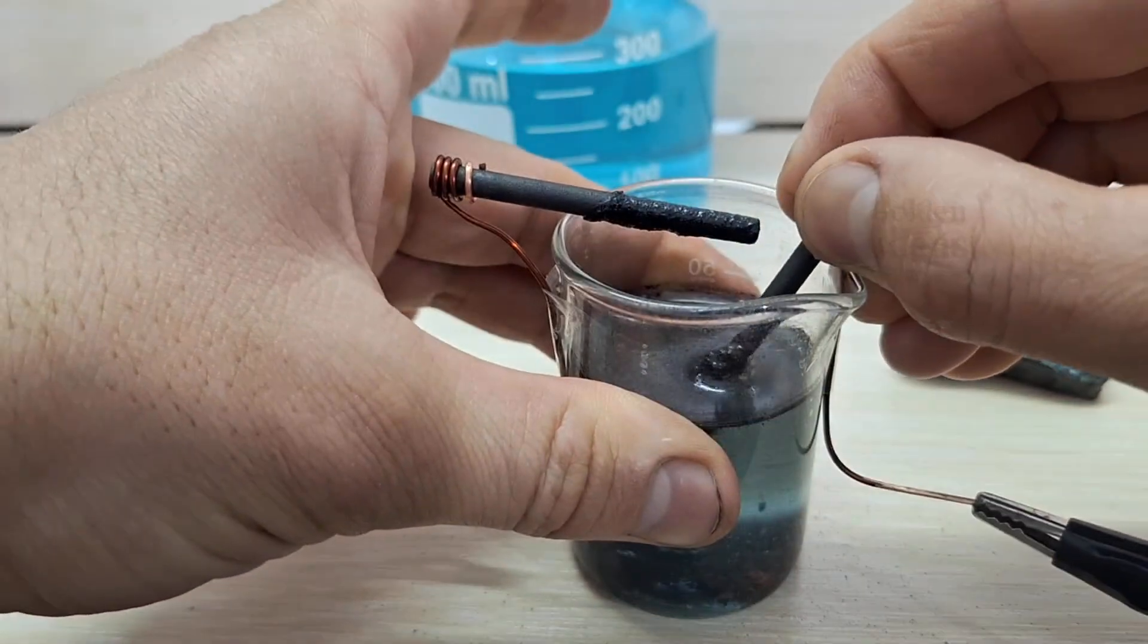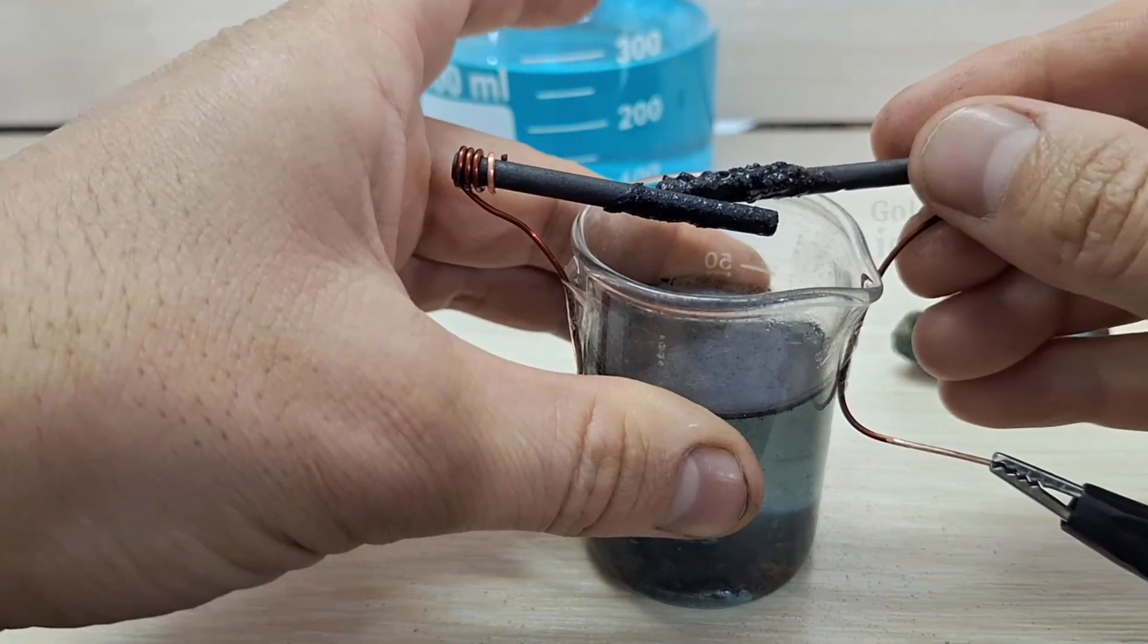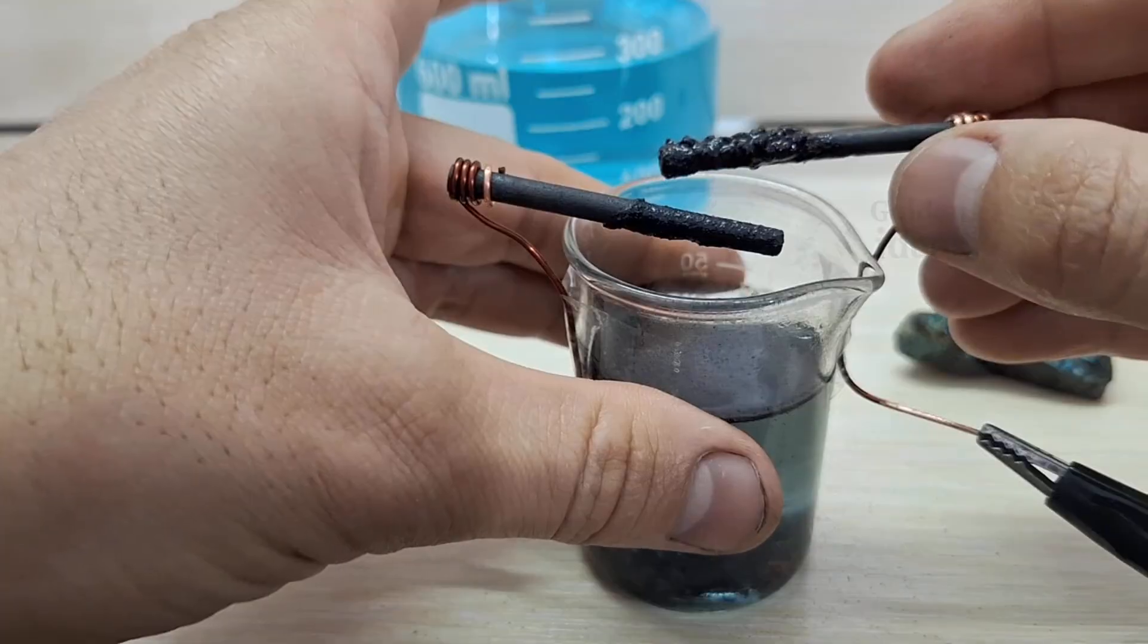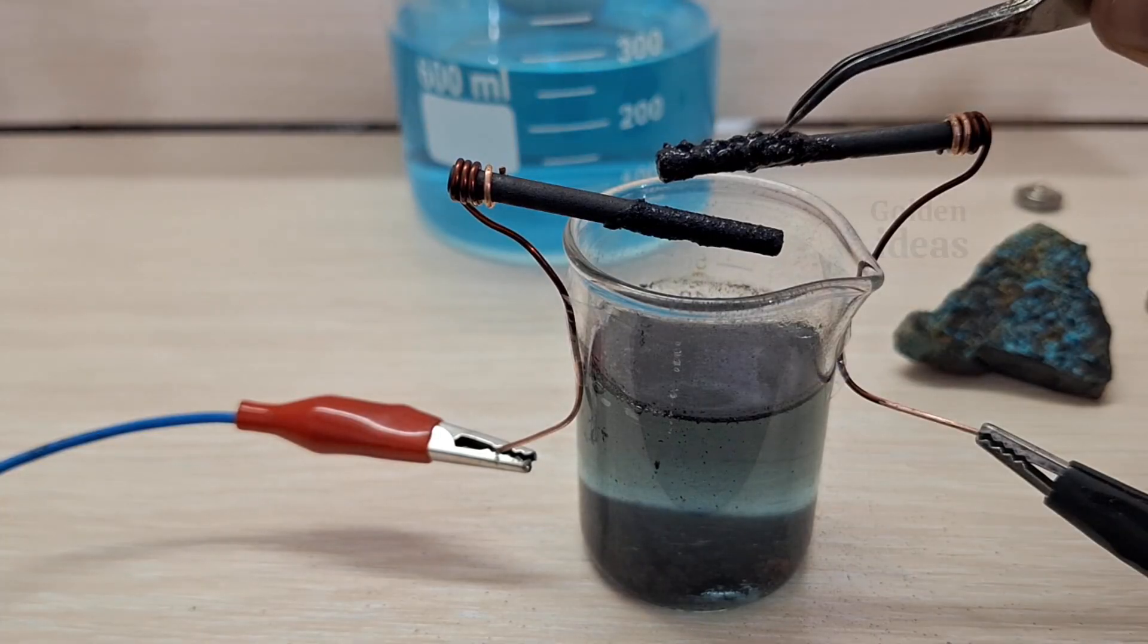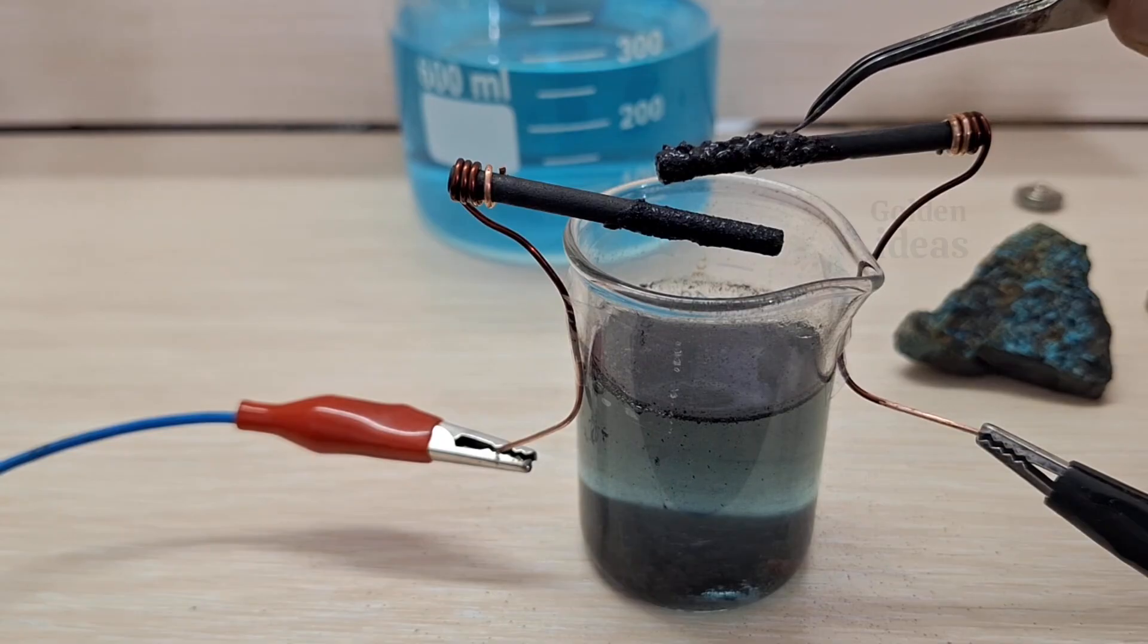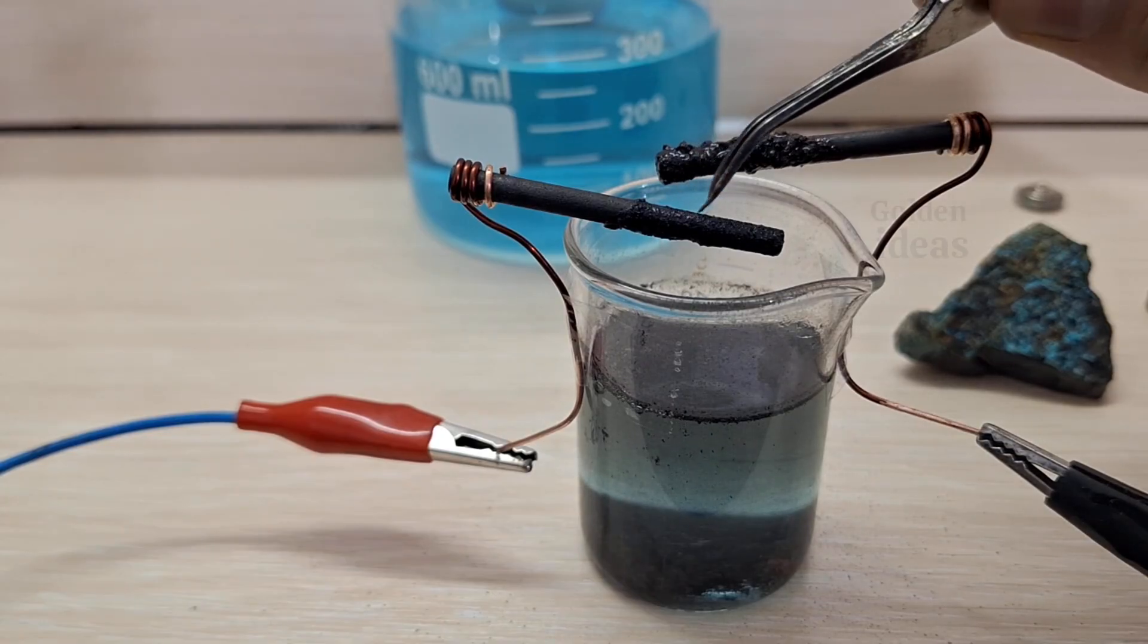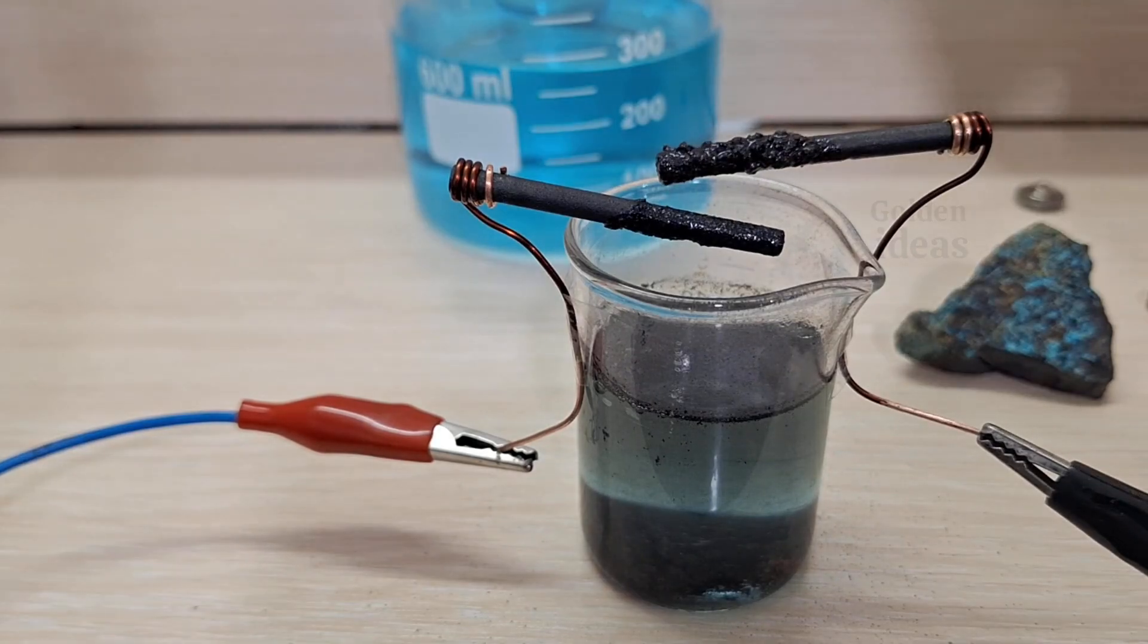Let me now remove the electrodes from the solution so we can see what actually happened. As you can see, the electrode at the anode doesn't seem to have decomposed at all, even though it looked like it was breaking down in the solution earlier. A significant amount of metal in powder form has stuck to the cathode, which means it's holding metallic elements.